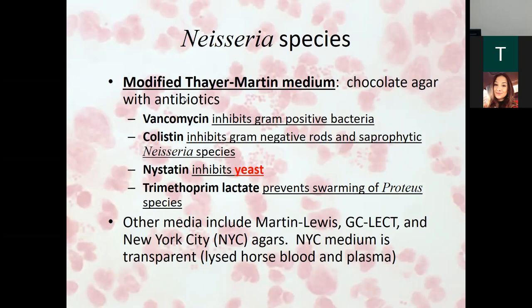So with those, it'll be the little round discs for the antibiotic? No, they're mixed in. They're added to the agar. We put that inside the agar and poured a whole plate. It's all mixed in there. So the specimen is put on top of that, and it just doesn't grow. It tries to take up, but those antibiotics are there and keep everything from growing. I don't know if that was a stupid question. That's just what I remember.